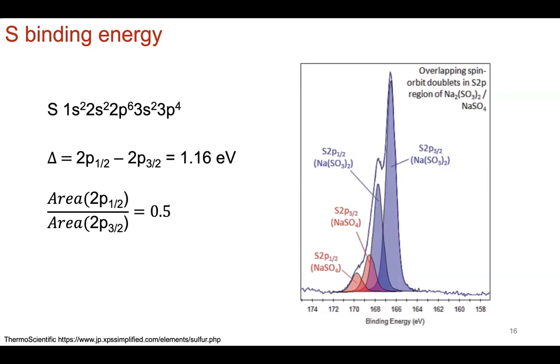Now, in terms of the binding energies, what you'll notice with all these plots, especially if you're looking at the orbital angular momentum of 1, so that's your p, your 2p, your 3p, is that you always see these doublets. Now, Patricia had a question about principal quantum number and the size of the separation of the peaks. Does anyone want to venture a guess as to why there are always these doublets for orbital angular momentum that is greater than 0, aka not an s orbital?